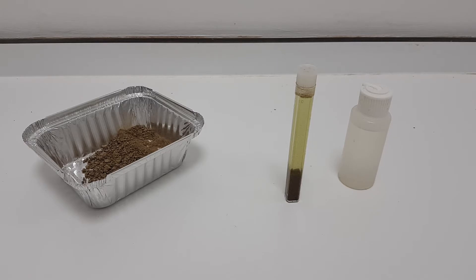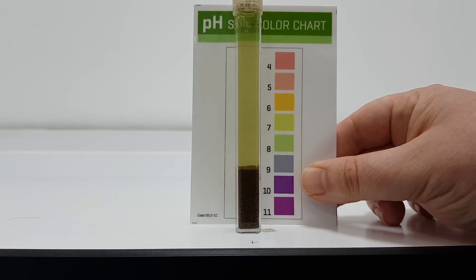Once the sample has settled, use the pH chart to read the result. To do this, hold the white part of the pH color chart behind the test tube. Then compare the color of the liquid to the colors on the chart.